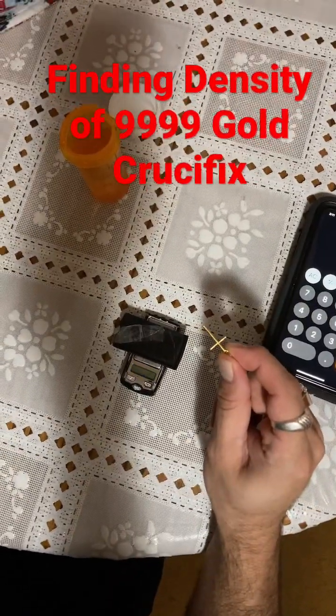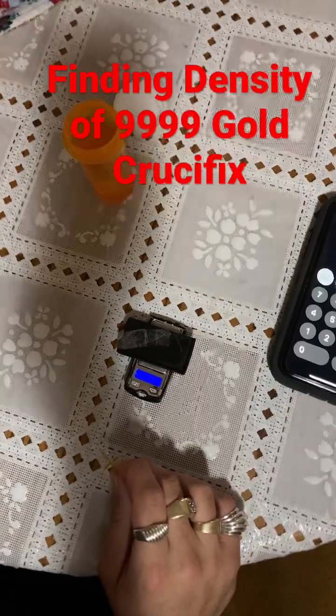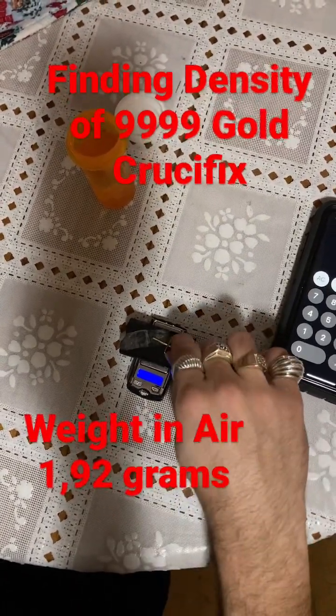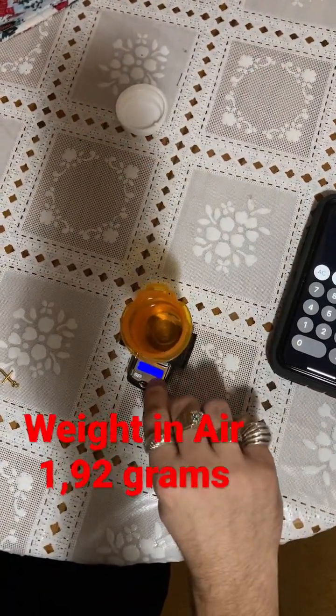We're going to get a density reading on this crucifix cross. I'll turn on my scale — we got 1.92 grams in air. Now I'm going to tare my scale.